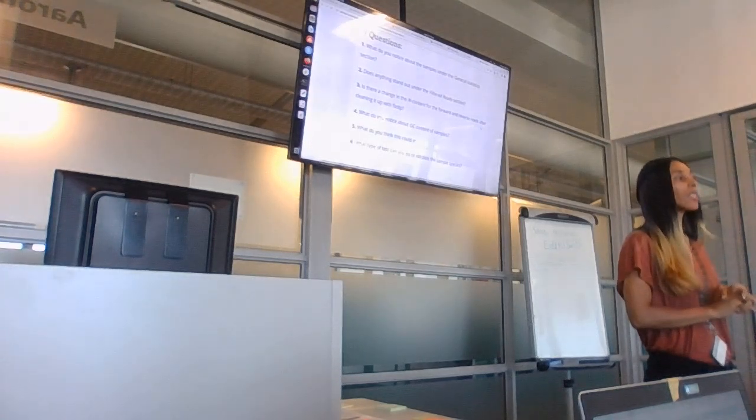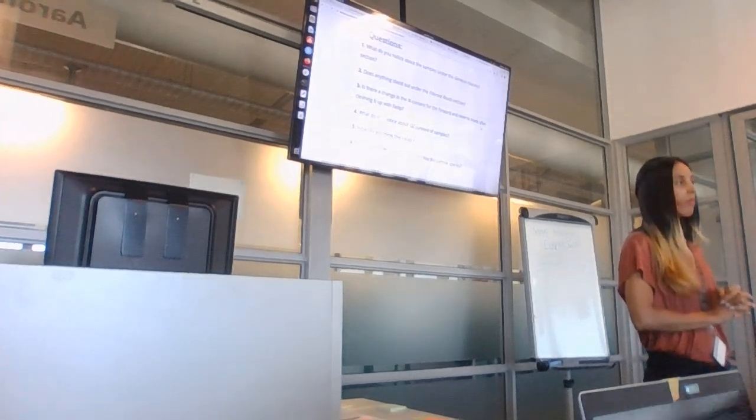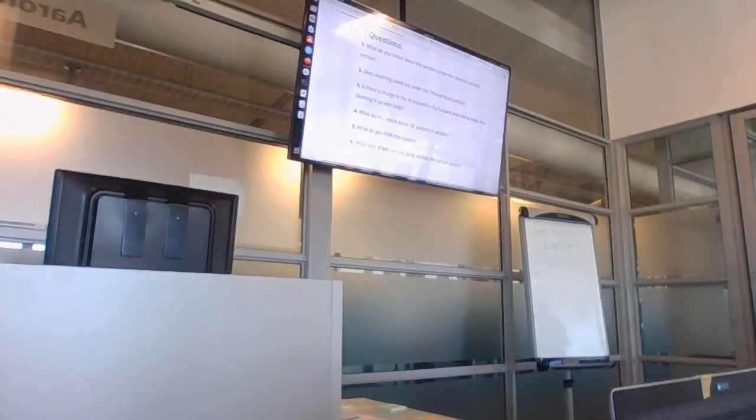If your MultiQC is running, can you please put up a green sticky note? Yeah. Okay. If you have issues, please put up a red sticky note. Yeah, that's right. That's all. Not running. Just look.